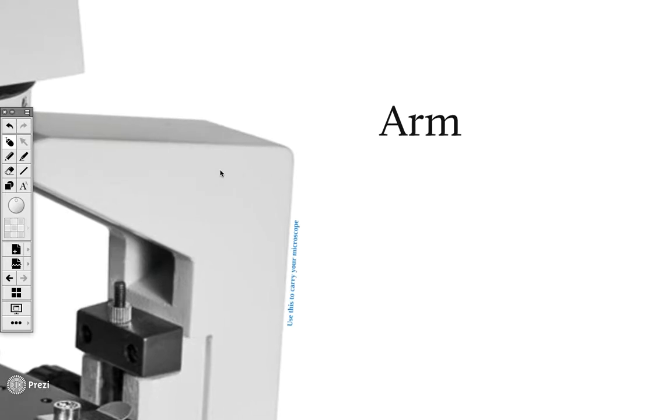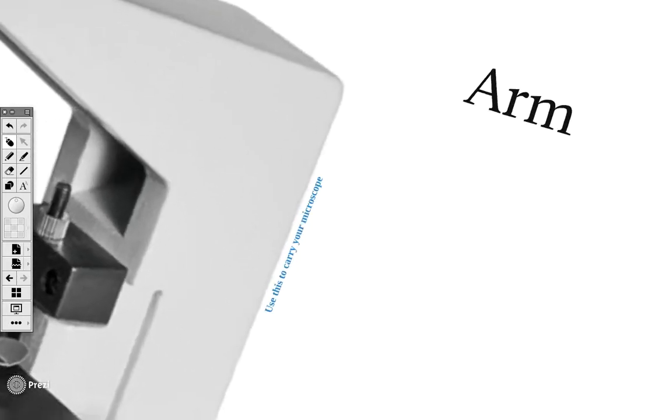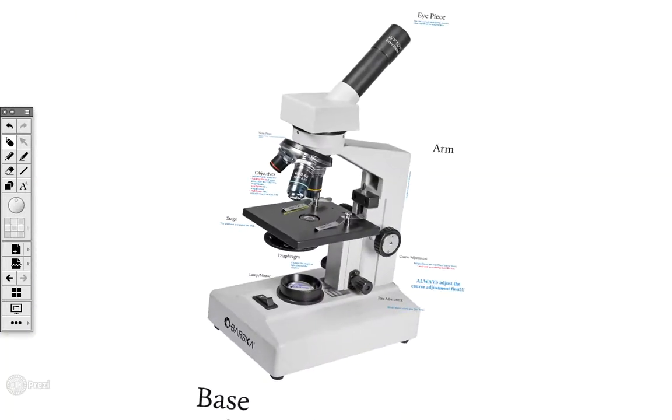Lastly, we have our arm, which is this side over here. The arm is used to carry your microscope, and that about does it for all of our parts of the microscope.